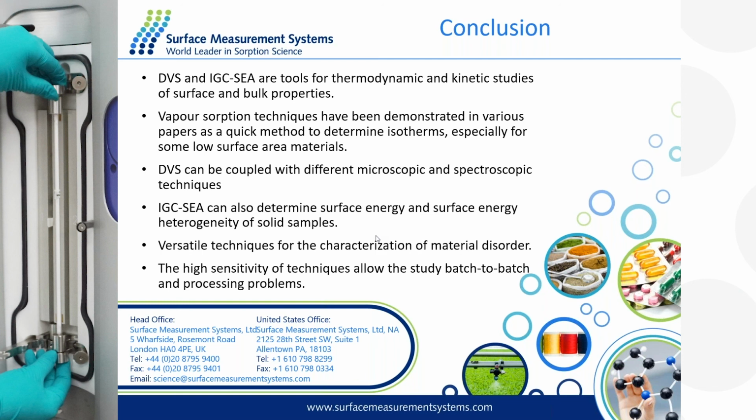Okay. We have another question, Meishan, from Nisha. Is there a trend powder samples follow after pretreatment? As far as I know, for nitrogen sorption, the different preparation methods and preconditioning conditions will have different effects on the final result. In the case of IGC measurements, the preconditioning is in situ before the experiment, just a flow of carrier gas, like helium or nitrogen, at a certain temperature.